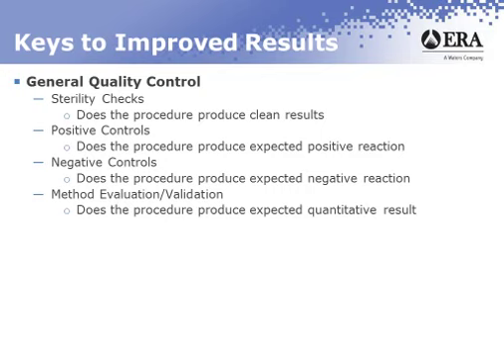You may have issues with your method or your media that you would see a too numerous to count plate, but if you were to dilute that down into, say, 100 counts, you may see that the media may not be up to snuff. So method evaluation is really important, and you want to challenge it appropriately.